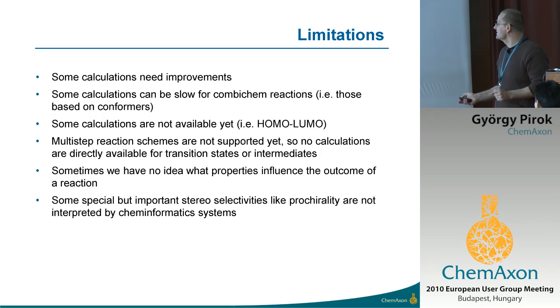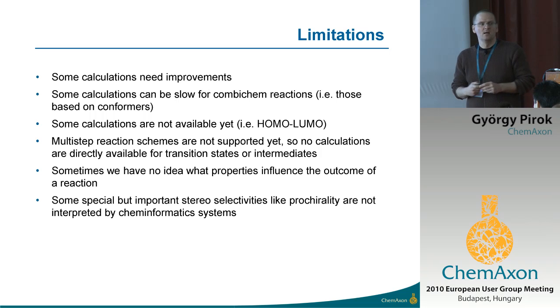And some stereo-selectivities are not supported yet, not supported by anyone else. So we support double bond stereo, tetrahedral stereo features. So we have inversion, retention. And we just found out how to support prochirality. So this will be coming, I hope, in the 5.4 release.